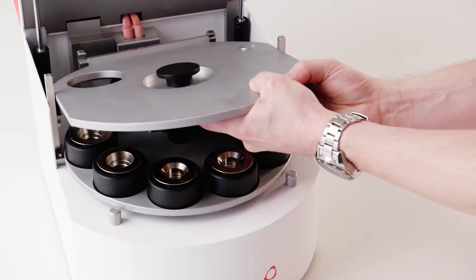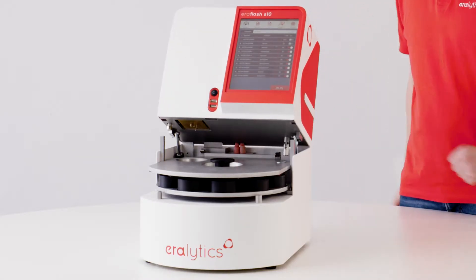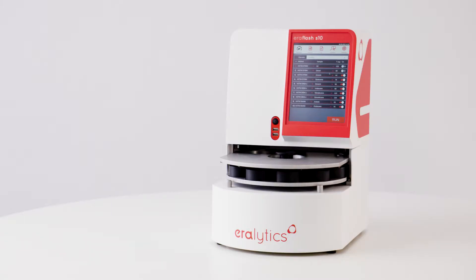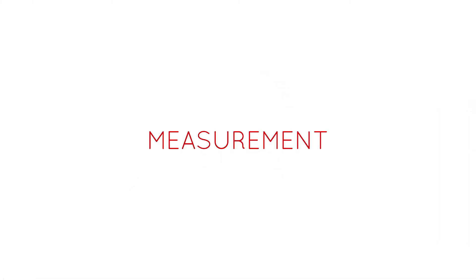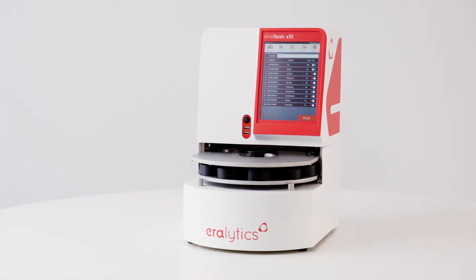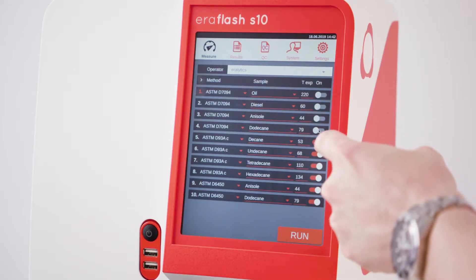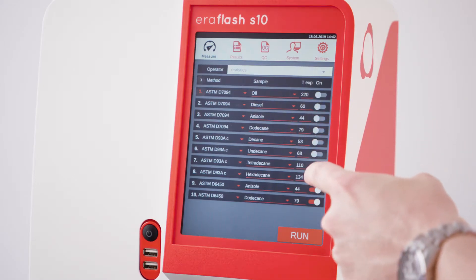Mount the lid on the rear brackets, then gently close the lid and the control case. The instrument is now ready to use. Measurement. The intuitive user interface guides you through the measurement.